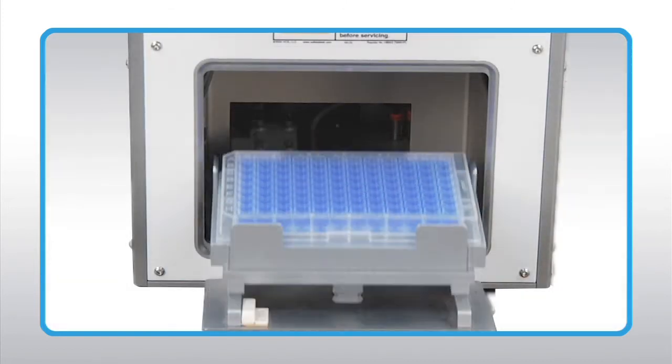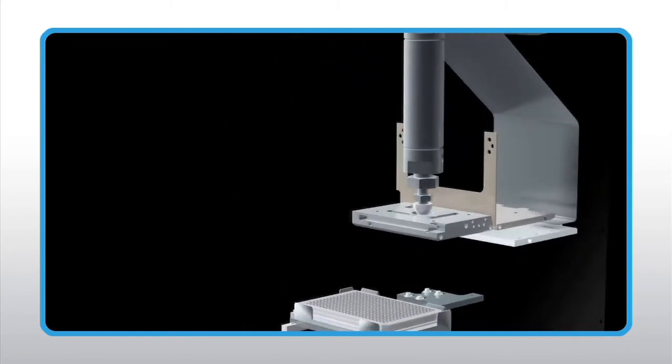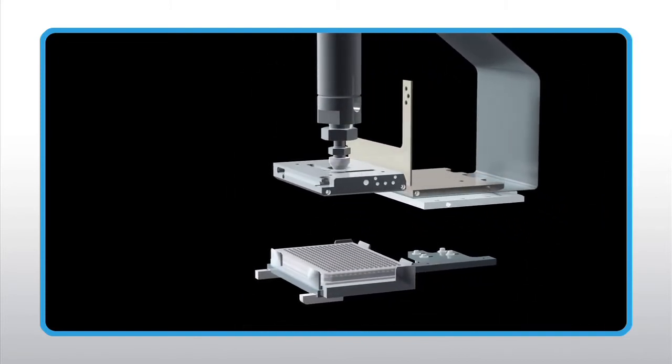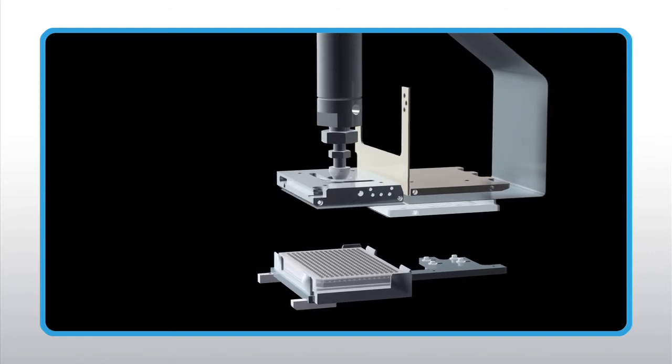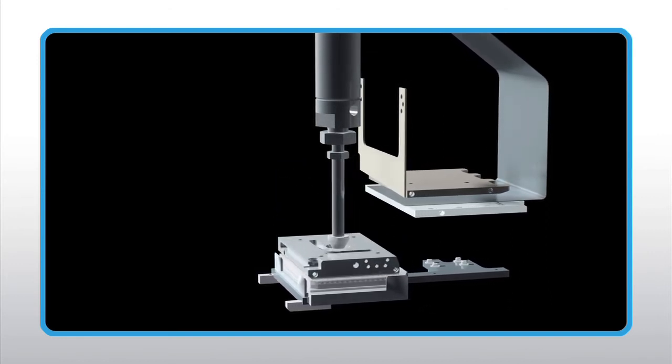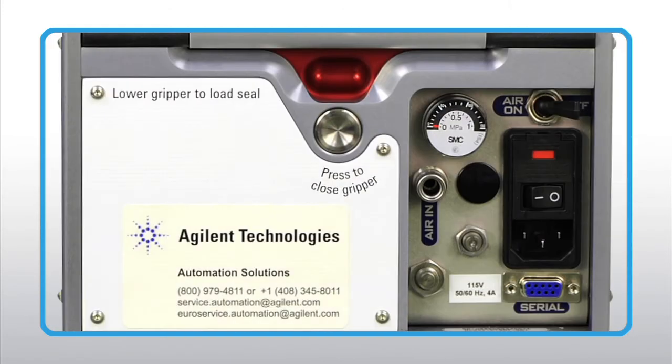The sealing cycle begins when the automated plate stage delivers the microplate to the hot plate sealing position. Roll-fed heat seal enters the rear of the chamber. A vacuum transfer plate delivers the heat seal to the sealing position, where it is cut to size and applied to the microplate.